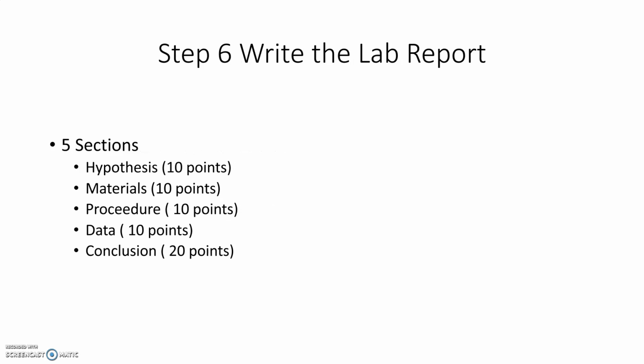And then you're going to write the lab report. Tentatively, it would be due Monday. It'd be your work for Monday. And then we'll start something new on Tuesday. Then there are 5 sections: your hypothesis, your materials, your procedure, your data, your conclusion. And I have a separate document outlining that and how you do that. It's pretty straightforward. I mean, really, the first 4 kind of do them. I mean, they kind of write themselves.